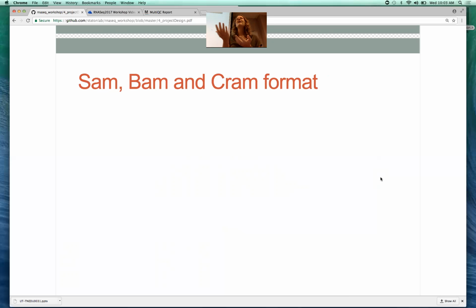Yeah. And you can have really important things, like a transcription factor flips on. It's never super highly expressed, but it causes this huge downstream cascade of other things. But if you're trying to find that one transcription factor, it's not as highly expressed as everything downstream, but you really need to identify that. You have to build up coverage at that lower expression level so you can see it in your samples. Does that make sense? And that's why they were saying with the depth, you have to increase the depth to see those lowly expressed genes.